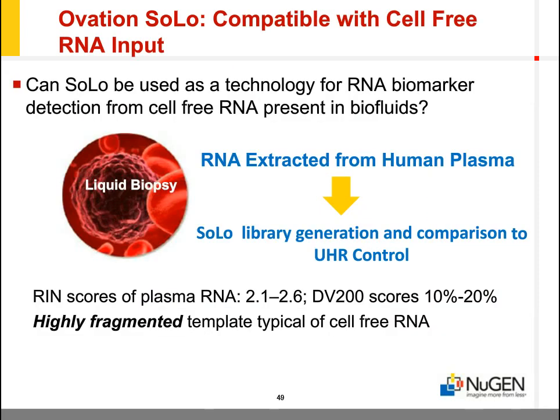We have also tested whether the Solo technology has utility as a method for RNA biomarker discovery using cell-free RNA as input material. This would enable Solo to be used in liquid biopsy type experiments where a blood or plasma sample can be used to detect and monitor disease state rather than a more invasive solid tissue biopsy.